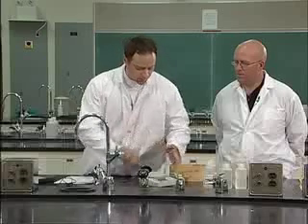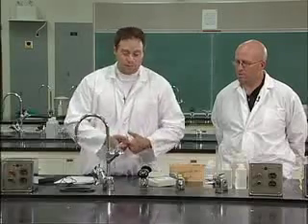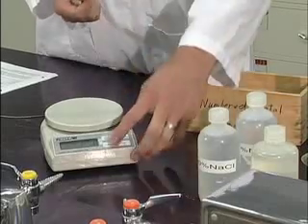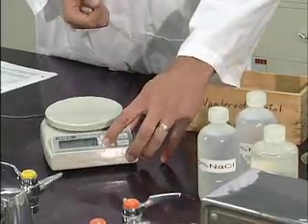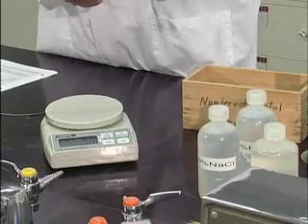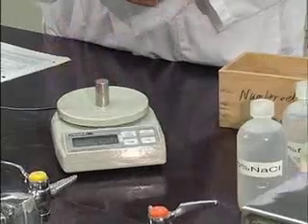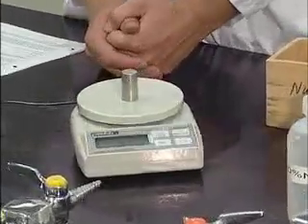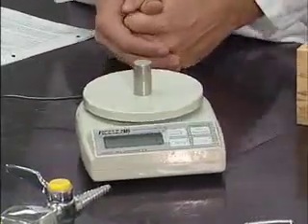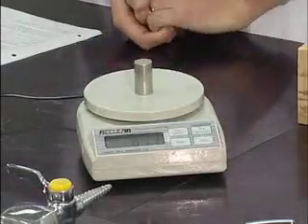To weigh your sample, you're going to use one of these scales, the Acculab scales, and before you weigh your sample, you always have to tare the scale so that it reads 0. So when you come to the scale, make sure you turn it on, make sure you hit the tare button, and the scale will return to a 0.0 value. You're going to place your sample in the middle of the scale and read its mass to the nearest tenth of a gram. So this one here reads 69.1 grams.